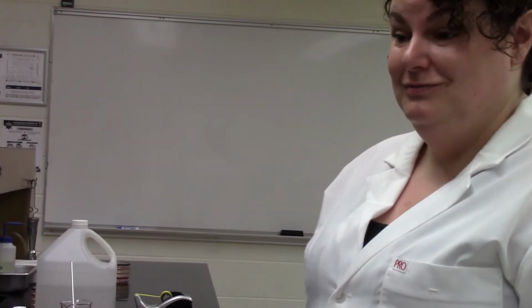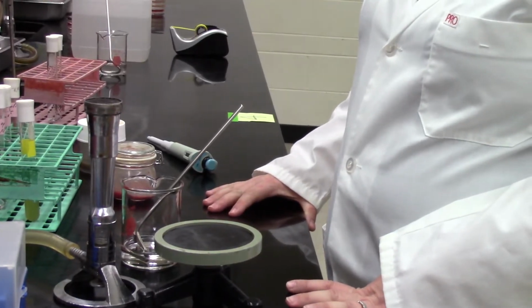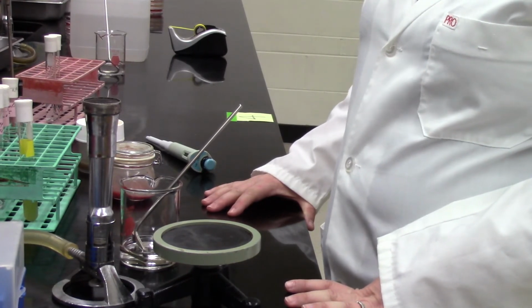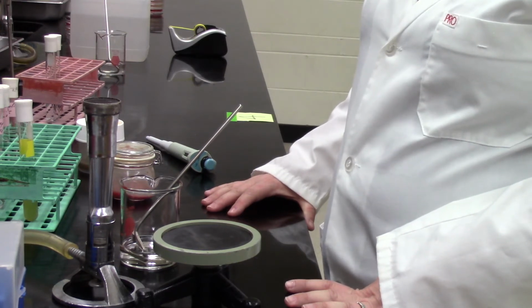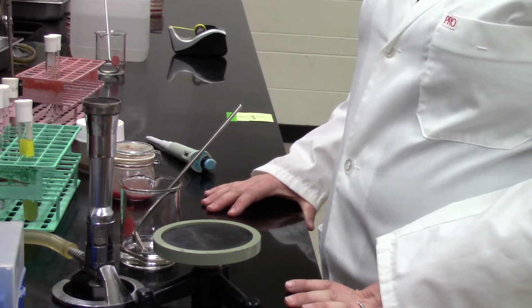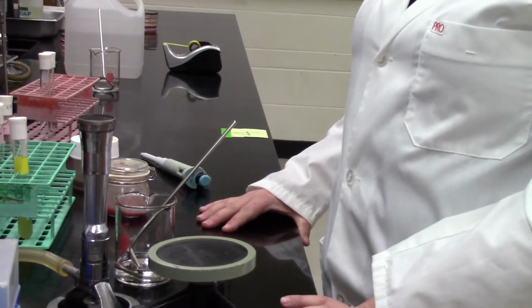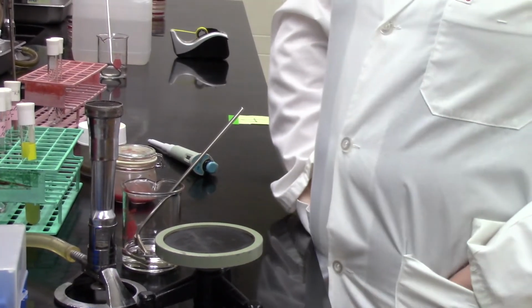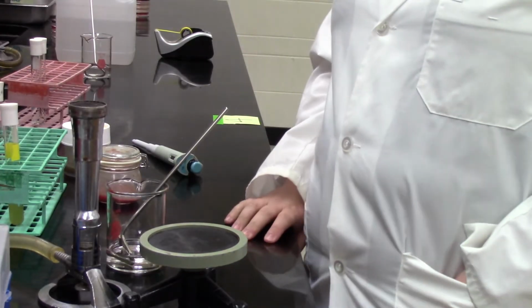You'd be glad that this is not a full sensory experience, because you do not want to smell that. Anyway, going forward, you guys will get experience doing these kinds of dilutions. This is just a taste of the first steps of making a dilution series. And the wrong time to use it to taste. I certainly hope not. No, we're not tasting anything in this lab. No tasting is ever involved. Especially not the meat juice.